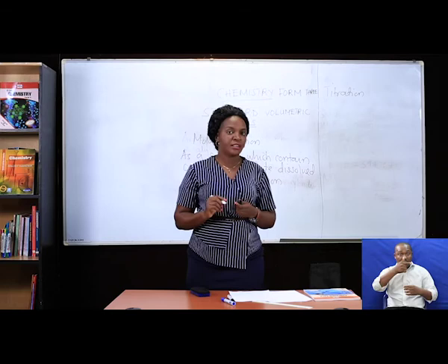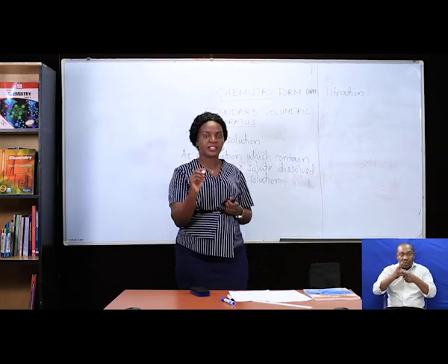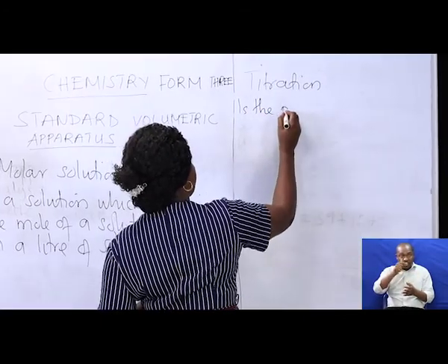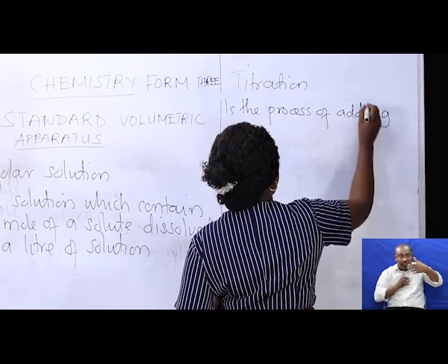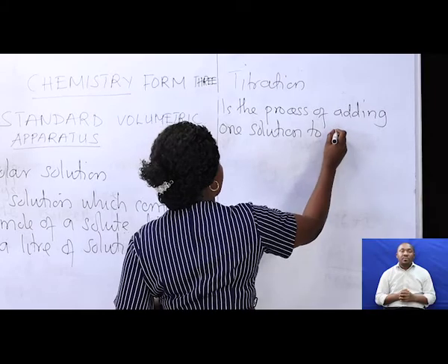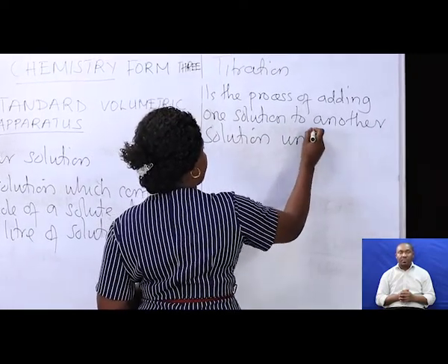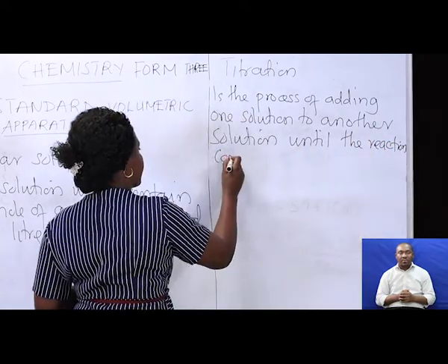Titration is a process of adding one solution to another until the reaction ends or until the reaction is complete. That is the meaning of titration. So, it is the process of adding one solution to another solution until the reaction is complete.